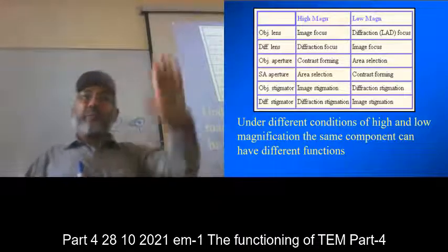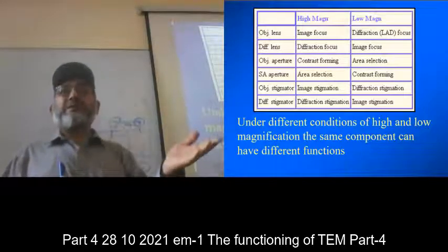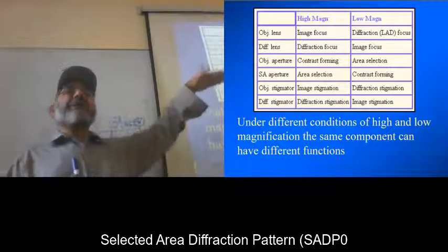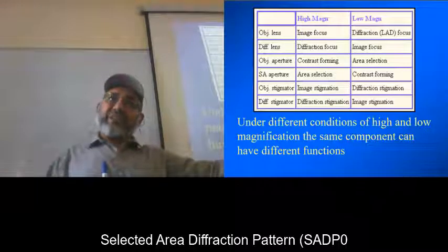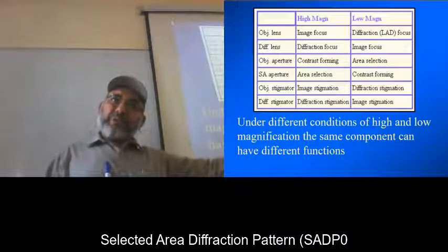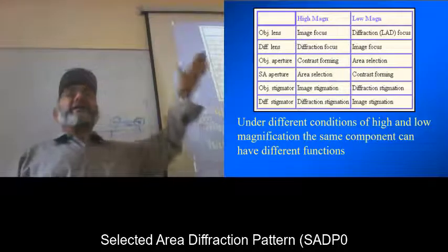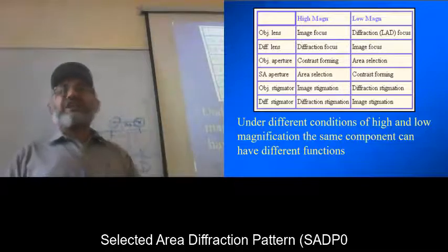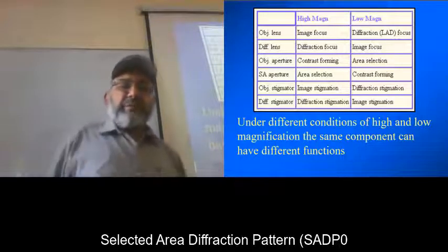And when it is 100% bright, this means that the beam has completely transmitted and has not interacted with the sample. So the brightness comes from the transmitted beam, and the dark and gray regions come because of the diffracted beams.